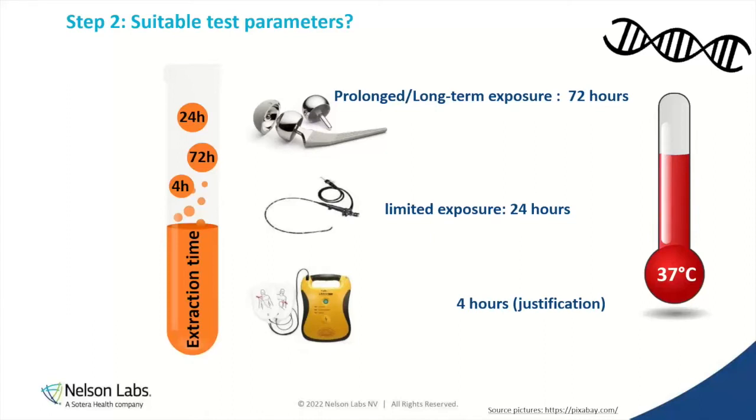So this is the time that the device is extracting in the minimal essential media that Lisa showed earlier, so MEM. So we can do typically 24 hours or 72 hours. And you can see here, we make that decision based on the contact of the device with the patient. So prolonged, like a permanent implant, would of course be extracted for 72 hours.